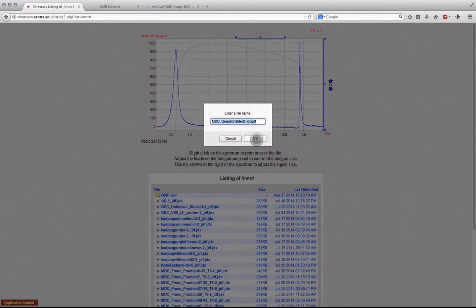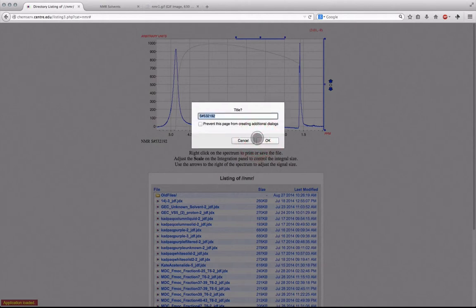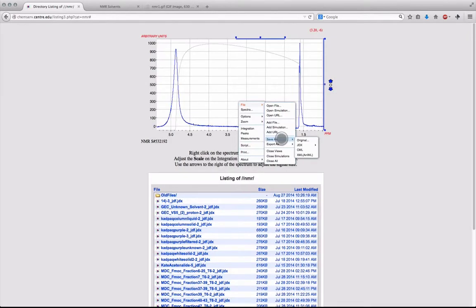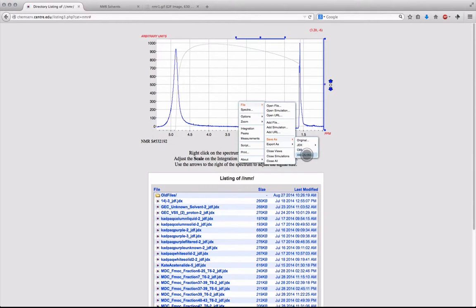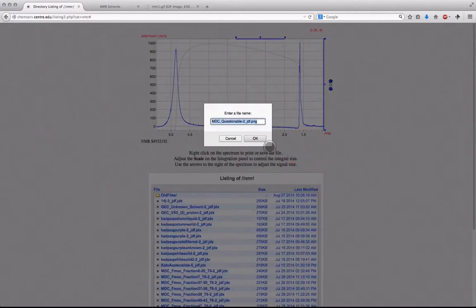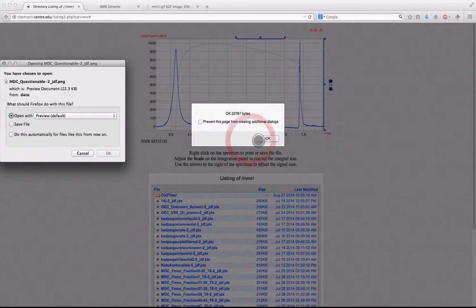Once you are done editing your spectrum, it can then be exported by right-clicking within the spectrum window, and selecting the export option you wish to use. PDF and PNG formats are available, along with others that will let you view the spectra within certain programs made for editing spectra.